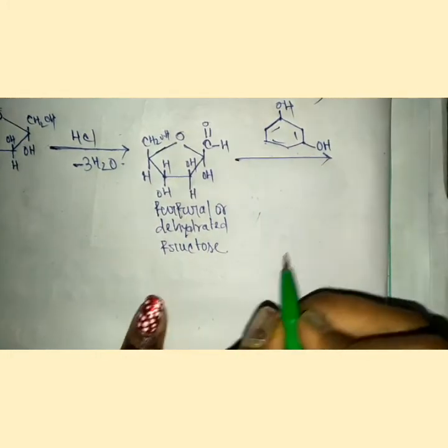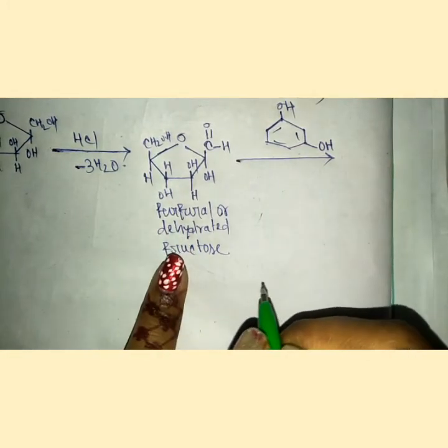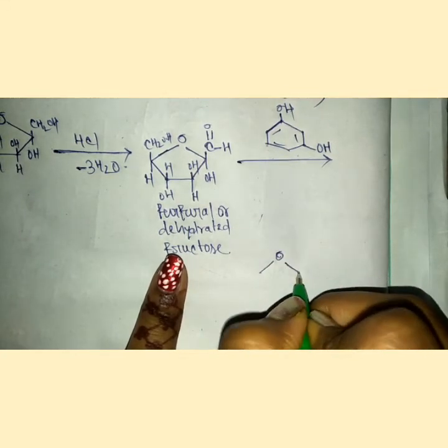Then we are going to add resorcinol. This is the resorcinol. After adding resorcinol, the furfural-resorcinol complex structure gives cherry red color.